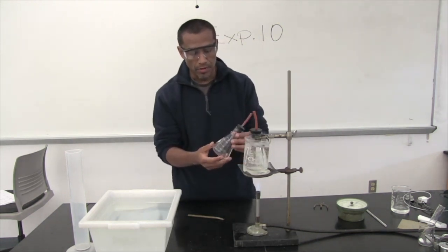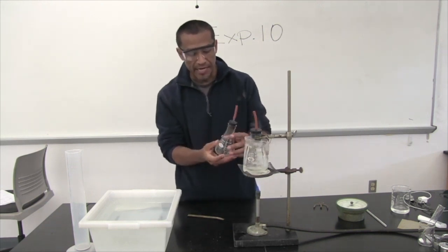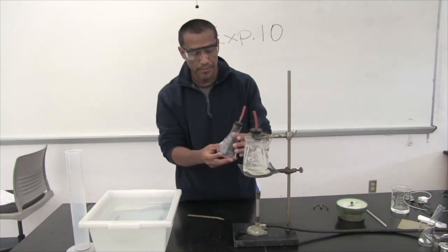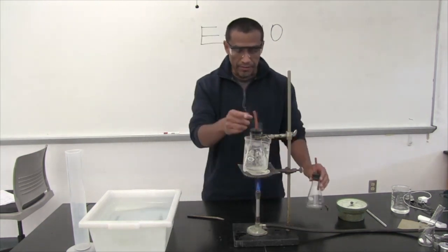Okay, so what I need to do is measure how much air we have inside, and for that I will do that for you guys. I will add water, fill this with water, and then measure how much water it holds. Okay, so here's the flask.